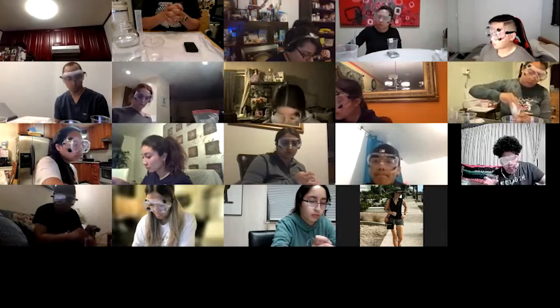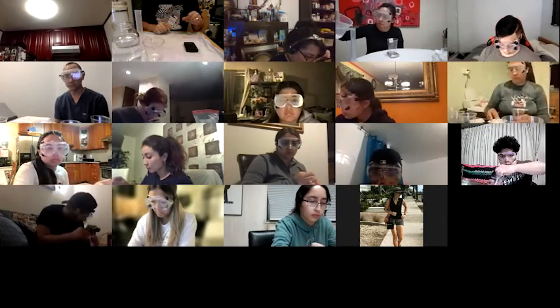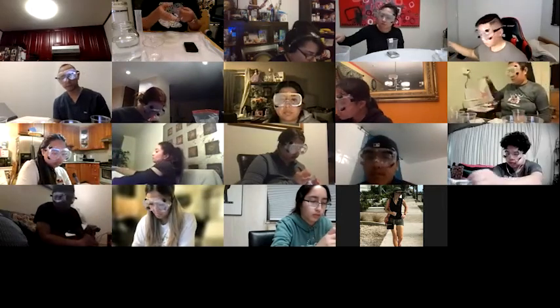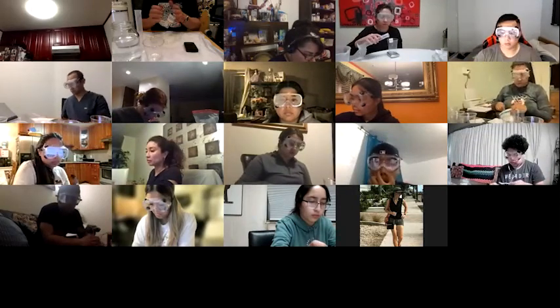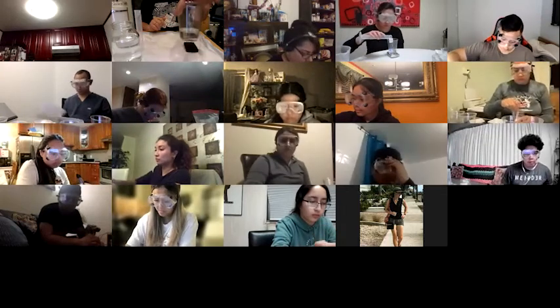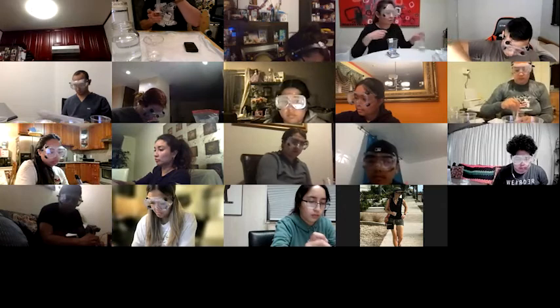The recipes are in the instructions, as you can see. So what I'm going to do now is go over how to measure the masses. Now that I have my 20% sucrose solution, how am I going to measure the masses of them?